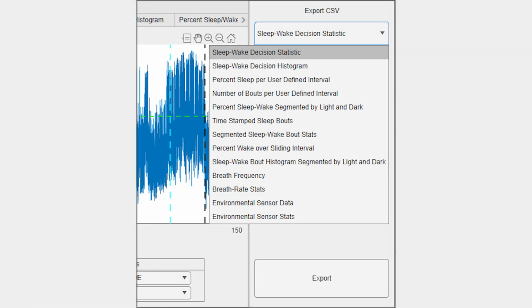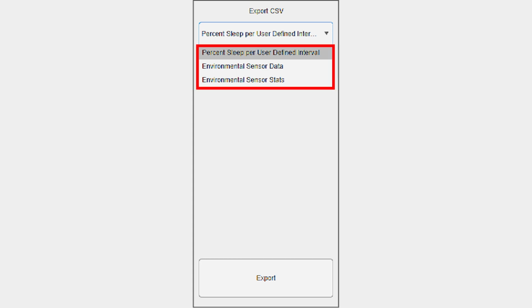While the graphic displays are good for efficient exploration of the data in sleep-wake behaviors, they may not be appropriate for some experiments. In this case, the user can export information to CSV files for custom analysis. This program has several options for exporting data and parameters to comma-separated variable files, which can be opened by other programs for further processing and analysis. This drop-down menu presents a list of options for exporting the data to a CSV file. The Lite version only offers a few export options.